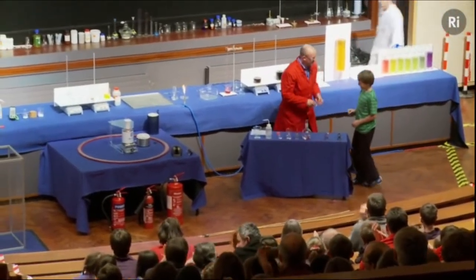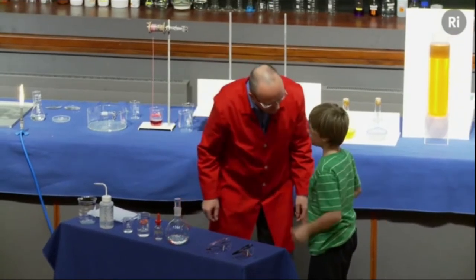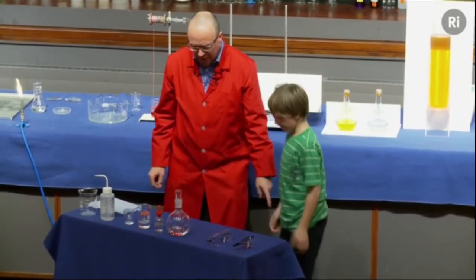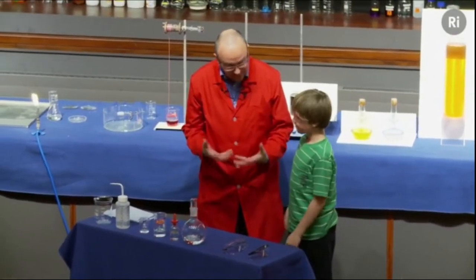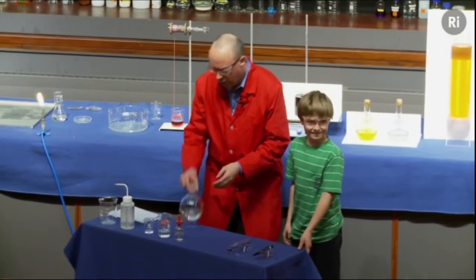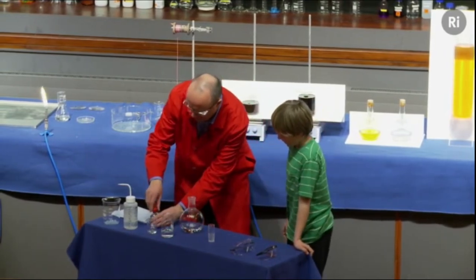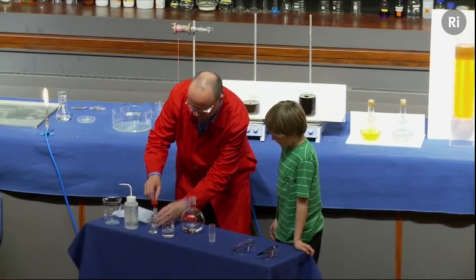If you'd like to stand there. Let's pop those on. What's your name? Dylan. All right, Dylan, if you stand just there, we're going to do some chemistry and we're going to make a solid. I'm going to start off with a flask that contains a solution of silver nitrate, and I'm going to add a little bit of ammonia.